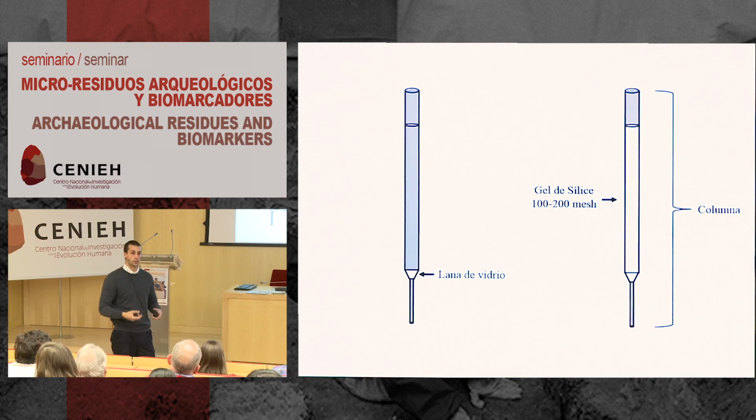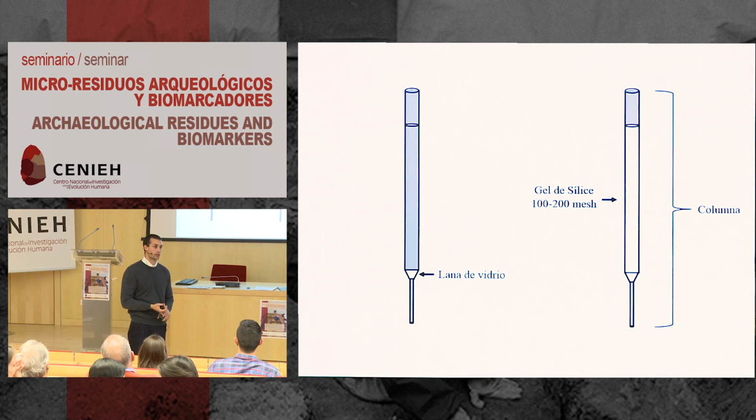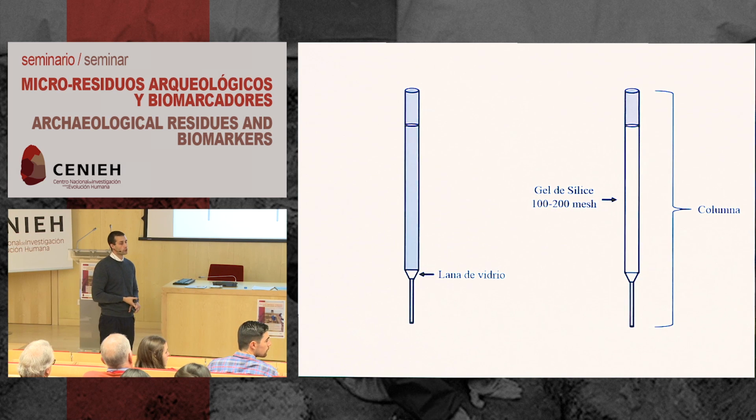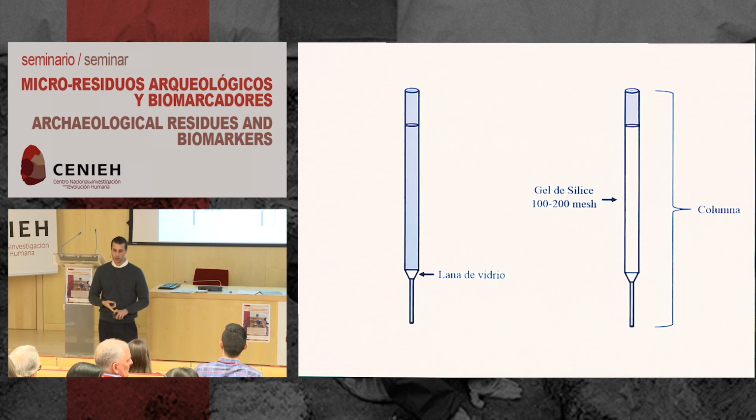But with the glass pipettes, we always oven bake them at 500 degrees to remove any organics on them. So we usually oven bake the 5 and 9 mil at the same time. 450 to 500 for 6 to 8 hours should typically get rid of any organic materials.